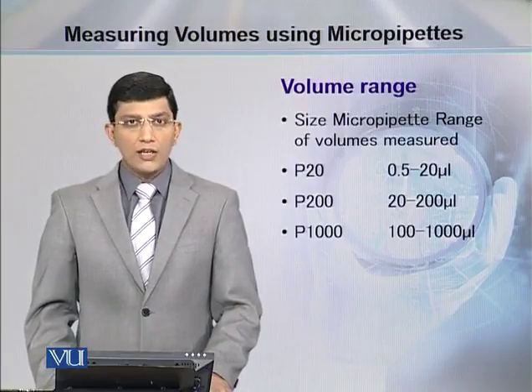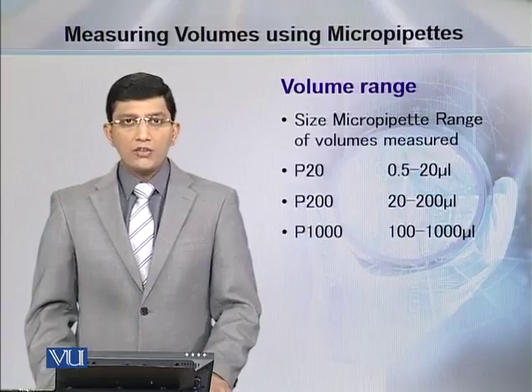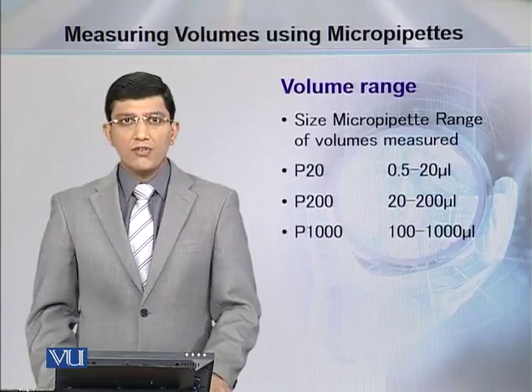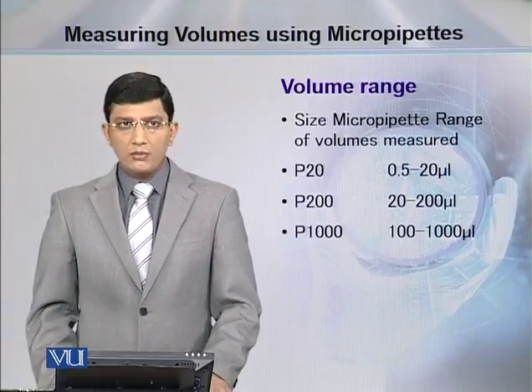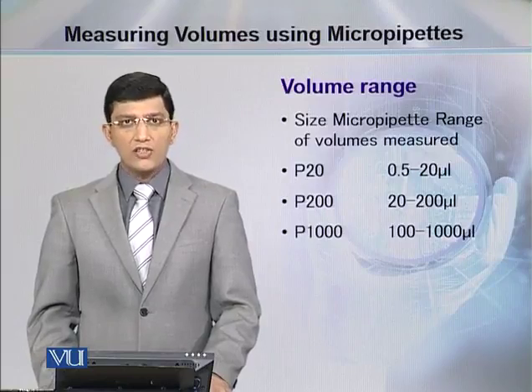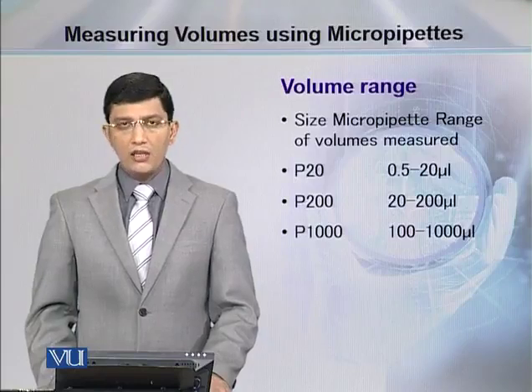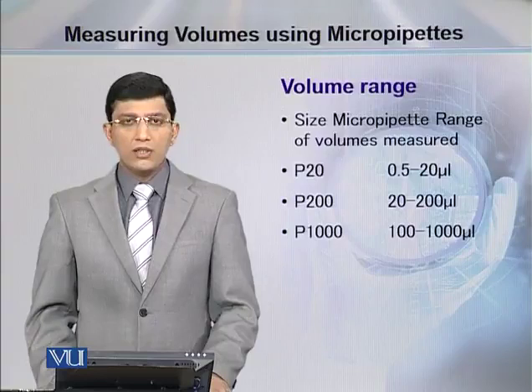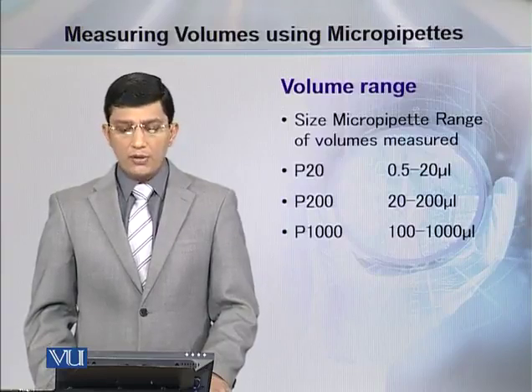जैसा कि पहले मैं आपको बता चुका हूं कि आपने जो नज़दीकी रेंज वाली माइक्रोपाइपेट यूज़ करनी है टू मेजर एनी स्पेसिफिक वॉल्यूम. जैसा मिसाल के तौर पे अगर आपने 50 माइक्रोलीटर वॉल्यूम चाहिए किसी भी लिक्विड का, then use P200. If you need 200 microliter, it's best to use P200, but you can also use P1000 micropipette.